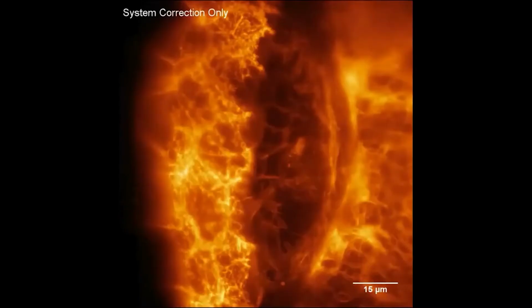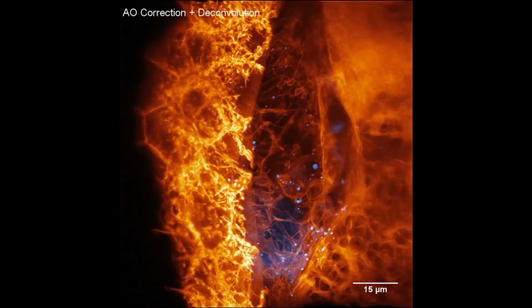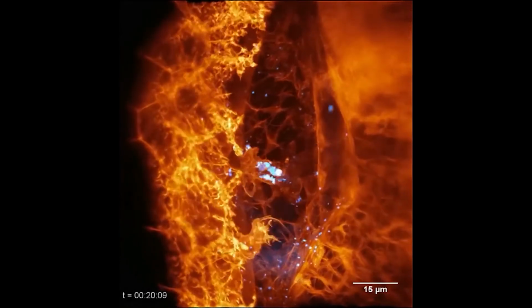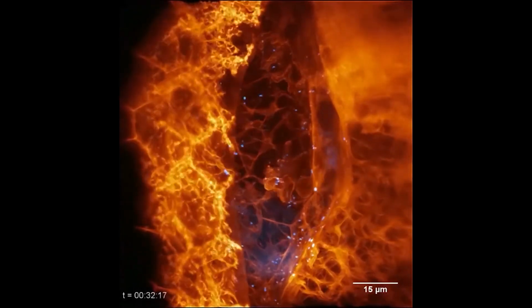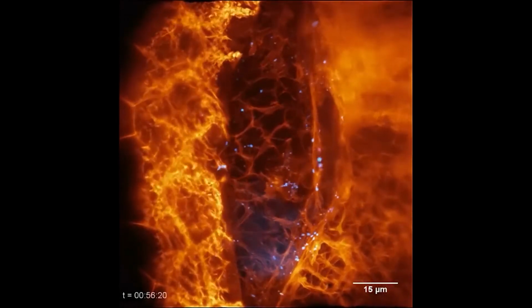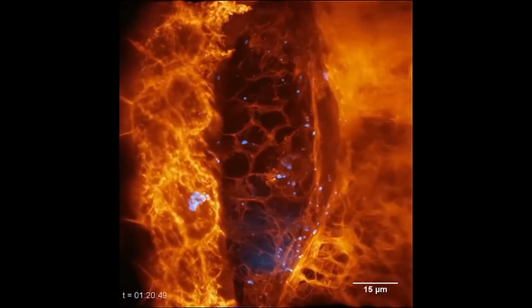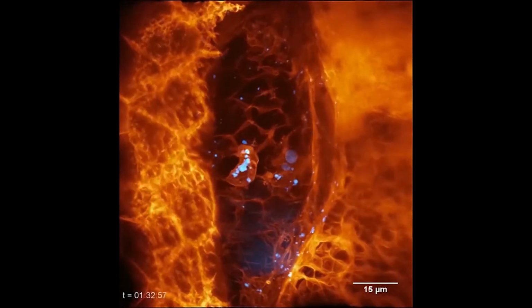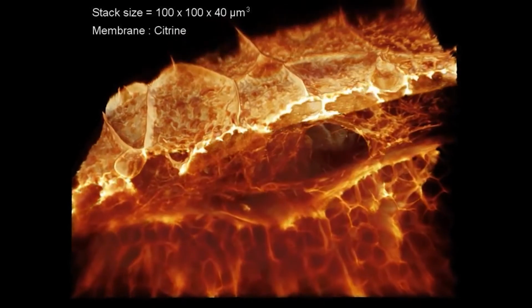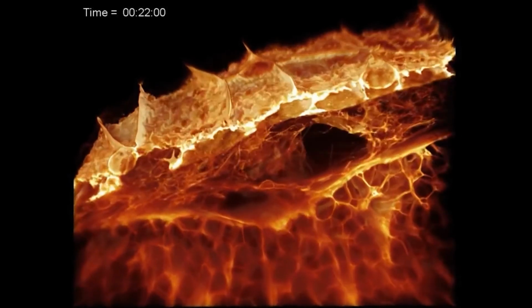Now, what are some of the limitations of this? Well, even though it gives us really, really great images, one of the major limitations is it gives us huge amounts of data. So like a minute of recording is like 0.62 terabytes of raw data, which gets doubled. So there's even more data because then they have to run it through the imaging process, the adaptive optics, which take up even more power. And you have to do it with processing to make the 3D video. And that can take several hours for a short one, several days for very long or complicated ones. And they actually have their own like little rendering farm to be able to do this. So it's very time consuming.